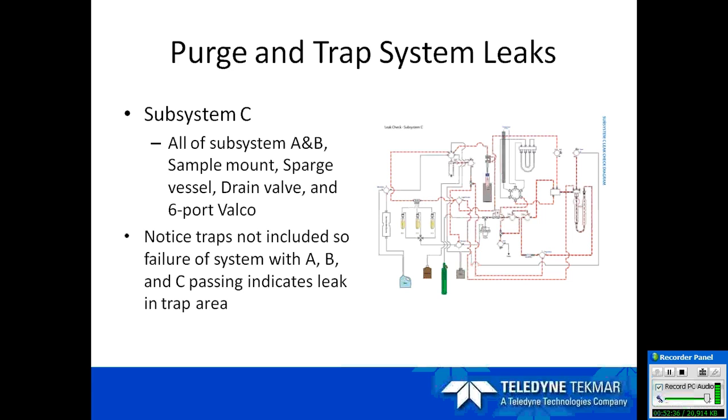So this is a unique way to break down the Atomx and its complex internal workings to troubleshoot the valves and the syringes. This goes along with the whole theory of not taking a shotgun approach. It is a way for us to make it a little bit easier to work in a step-by-step fashion in order to eliminate one variable at a time. So it will take you through each of these systems, because you are looking at a system that encompasses the purge and trap in it.